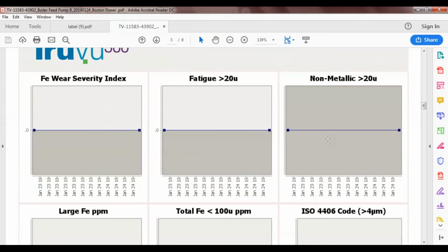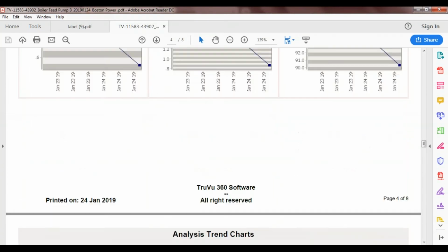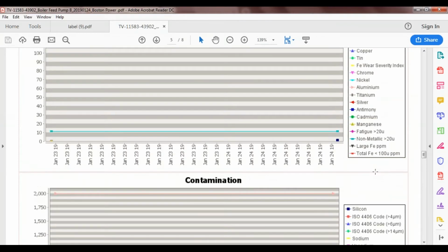Again, I just have 2 points in this, but I'm just going to go through quickly. These are the individual parameter charts. We have a lot of information already out there on the parameters that the Minilabs can measure. It's frankly far more than most people would need. And then we group them by trivector category as well.